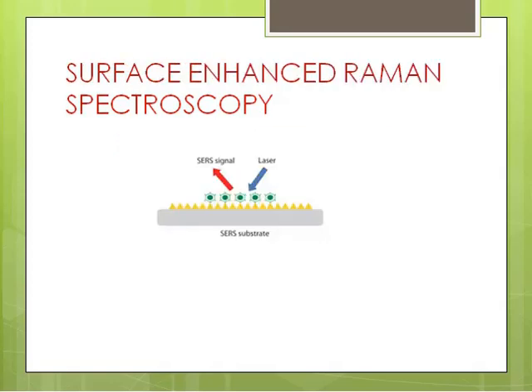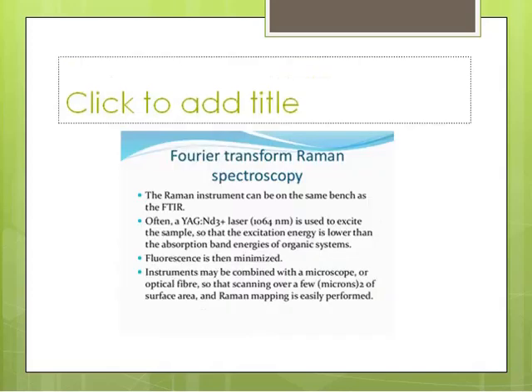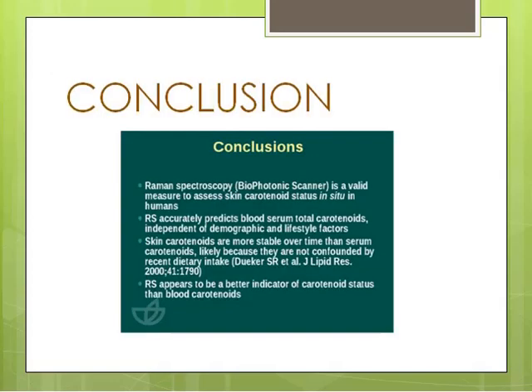And surface enhanced Raman spectrometry. We have some diagrams, let's see. And in non-linear Raman spectrometry we have some graphs, some pie charts, and Fourier transform Raman spectrometry. And finally, we have a conclusion.